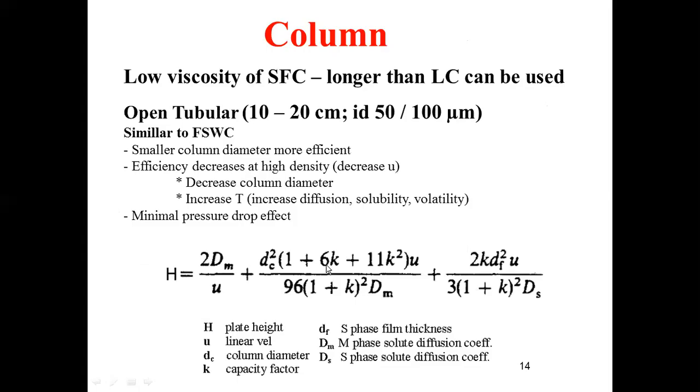As I told you, the lower viscosity of the supercritical fluid is an added advantage in performing the separation in supercritical fluid chromatography. And how does this enhance the separation? Because of the lower viscosity of supercritical fluids, whatever the length of the chromatographic column you require to perform the separation, you can use it.